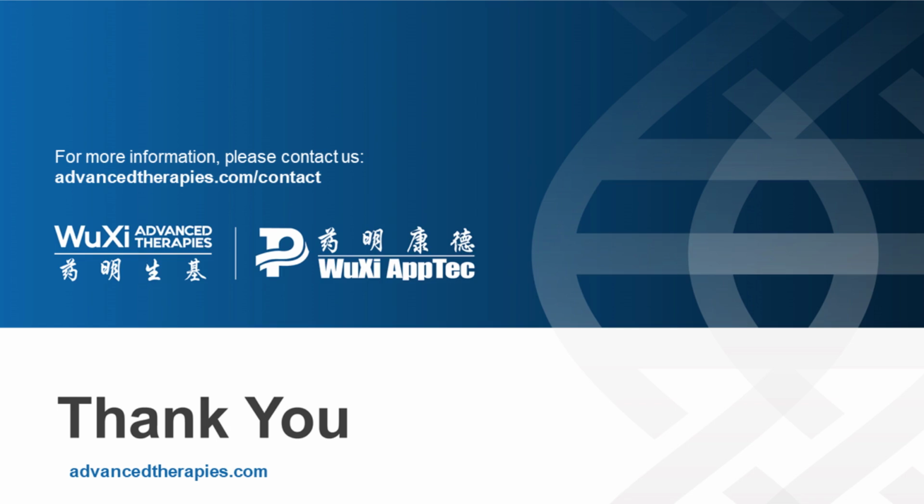Which AAV serotype in your experience is more challenging than others? How do you overcome the hurdle? That's a good question. From my personal experience, AAV2 is more challenging than the others. It's well known that AAV2 usually has a lower yield and is very easy to aggregate. So for WuXi process development to overcome this hurdle, we have our own dynamic light scattering machine to monitor each step of viral vector aggregation.